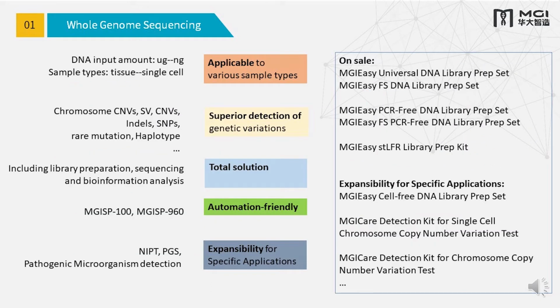There are some criteria to evaluate whether this library kit and product are good or not. You can see the data input and the sample types, whether it's limited to human or includes animals, plants, microbes, or any other species. And there are the variants in the genome: which kinds of variants are included in your sequencing data. Usually we only look at the SNPs and the indels.